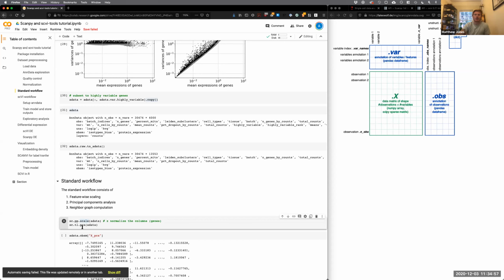Hey, Adam, correct me if I'm wrong, it might be pandas actually, that it's not the AnnData itself, but its underlying pandas objects. And if you're working with a view, you're modifying the underlying pandas objects rather than what you think you're modifying, which is a copy.